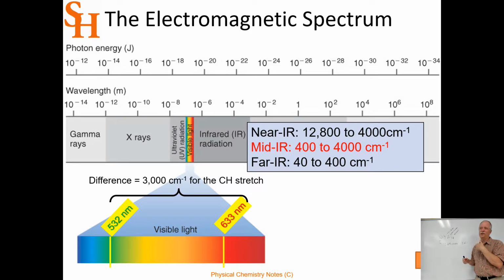And so if you're going to do a spectrum, you need to change the source. You need to scan the source somehow. So it's really difficult. But we could use it for Raman, bounce it off a substance, and the scattered photons can give us information about the vibrational spectrum, the vibrational motions. But still, using infrared gets us into the problem of having to use salt for our windows. So we'd like to get this into the visible.